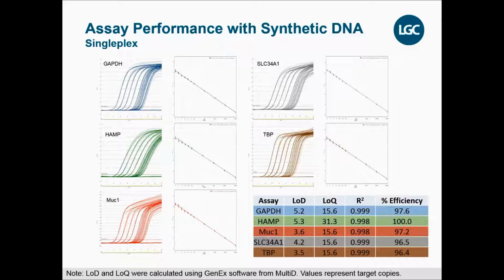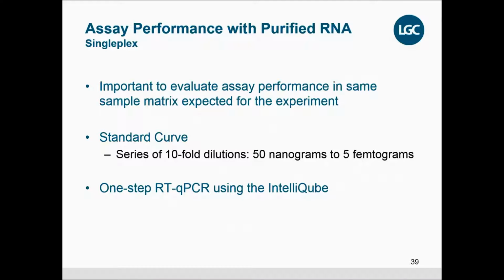And just to note here, our LOD and LOQ calculations were performed using GenEx software from MultiD. And the values we're showing for LOD and LOQ are in target copies, not necessarily a concentration, but actual target molecules.